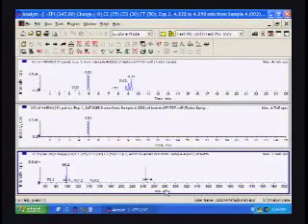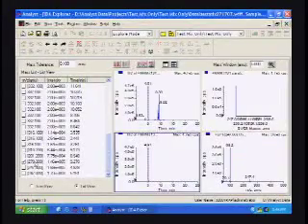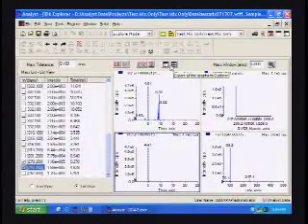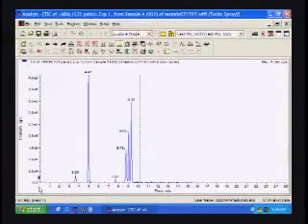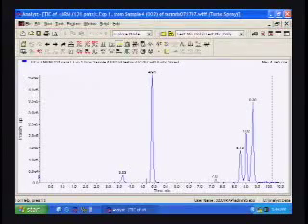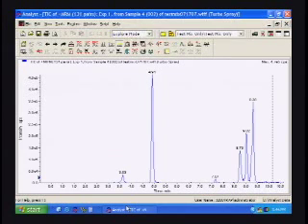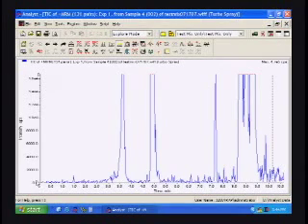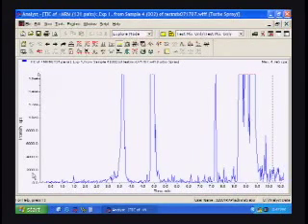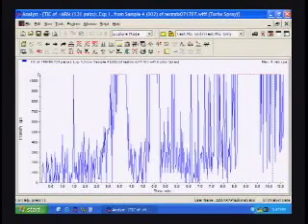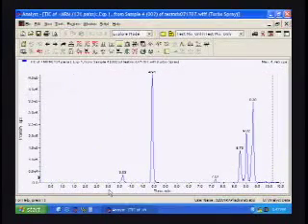So if I review my test mix in total—actually, we'll just look at the mepivacaine one more time. Export this one, just zoom in on the portion that has stuff in it. What we're looking for is the last thing in the test mix: we're looking for baseline. You can zoom in on the baseline. If the baseline is really less than 2×10^4 or something like that, then you know the instrument is not inherently dirty before you even run any samples on it. What I'm seeing here is a pretty low baseline. You can see the baseline—it looks horrible, but it's only 500 or a thousand counts, which is practically nothing. So that's the test mix we've created.